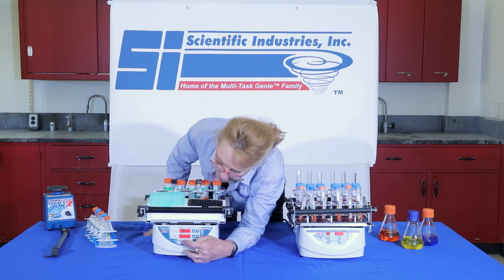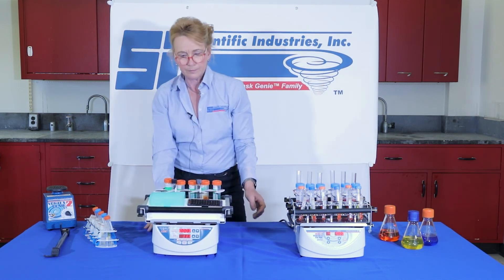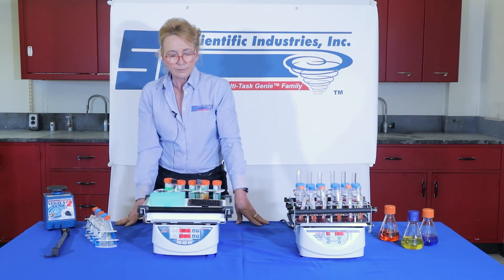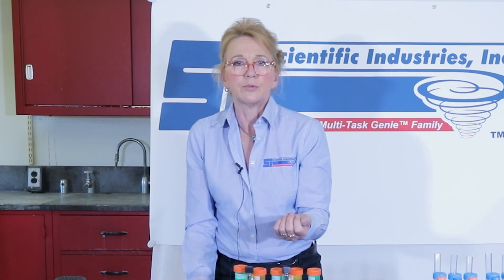We're going to put this in normal mode and just hit start. You get nice, even, well-to-well mixing regardless of whether it's a deep well or a standard plate.